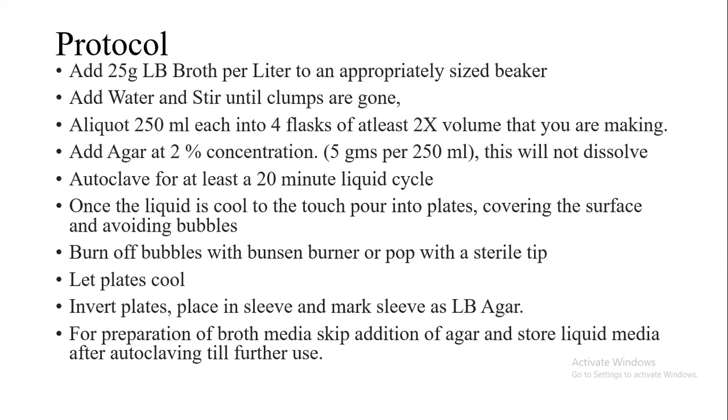We will seal our flask and then autoclave it for at least 20 minutes once it has reached 15 lbs pressure, which means 121 degrees Celsius temperature is reached in the autoclave.